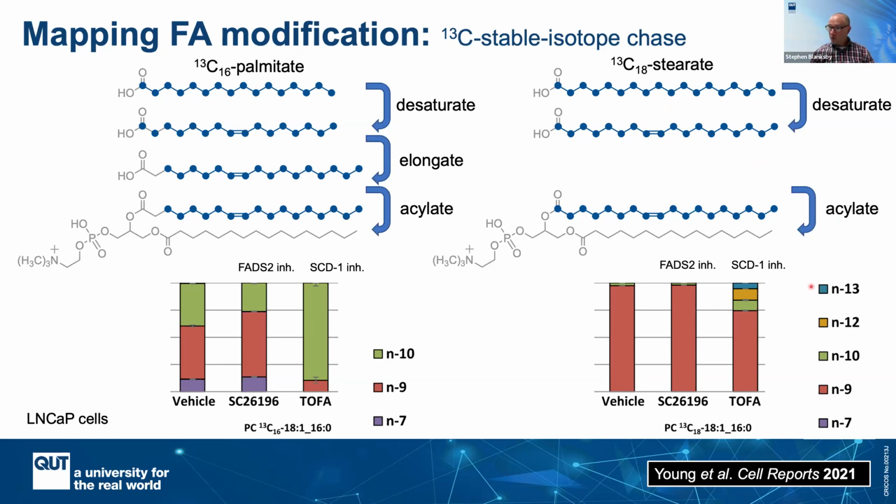And what was even more intriguing is we got these other desaturation pathways switched on. Here we started to see the N12 pathway opening up, and even the N13 pathway. So these would suggest that there's an even greater variety of pathways or substrate enzyme interactions that could be activated within these cells by essentially shutting down SCD1.